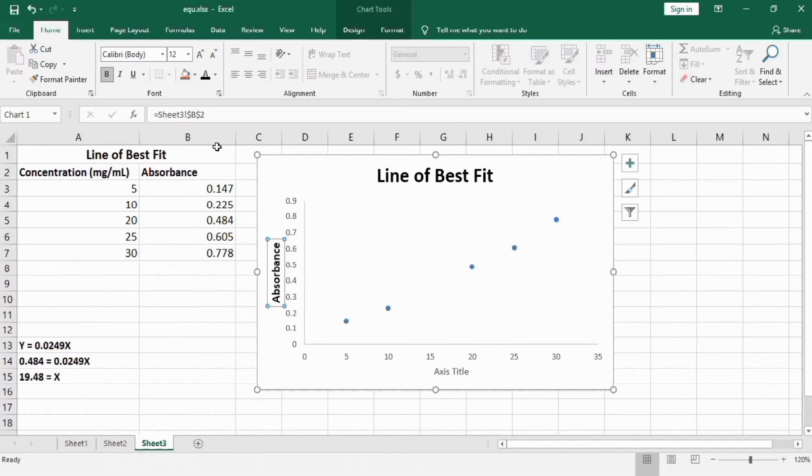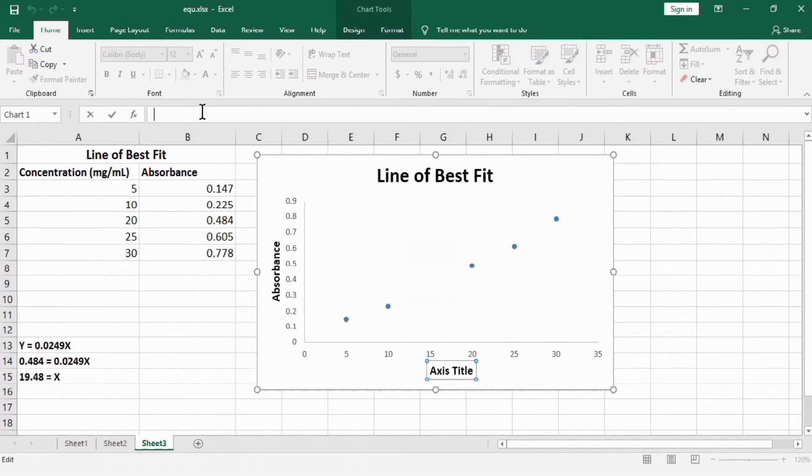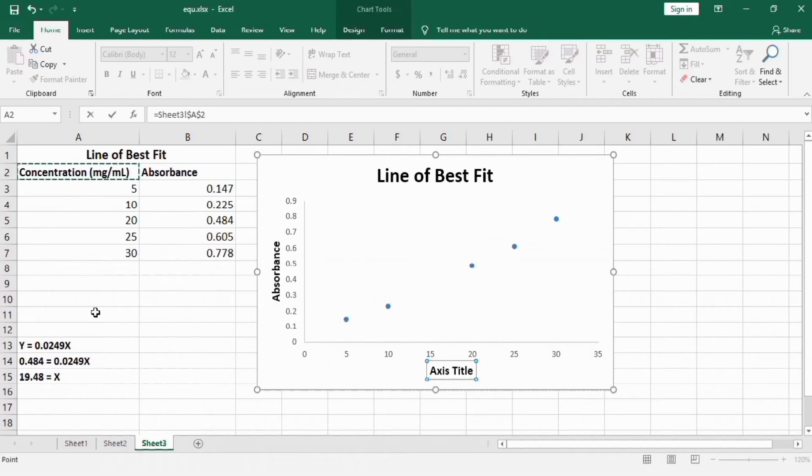Select this cell and use format painter to edit this axis. Now select this axis, put equal sign in formula bar, and select this cell. Press enter.